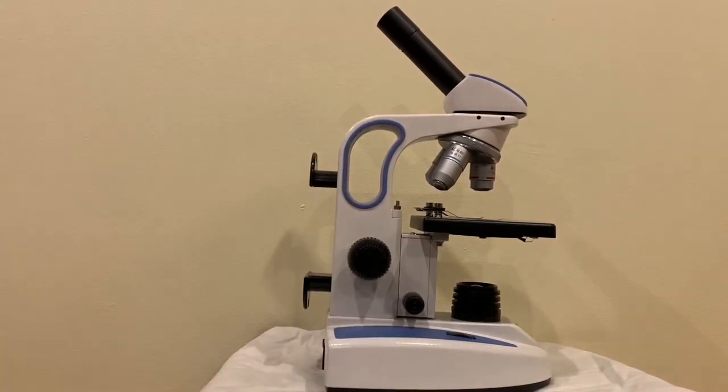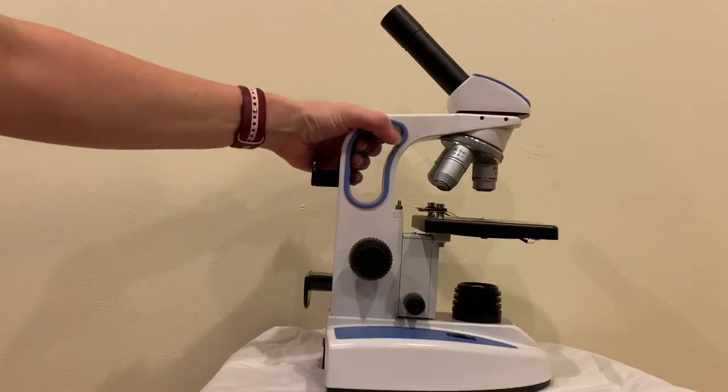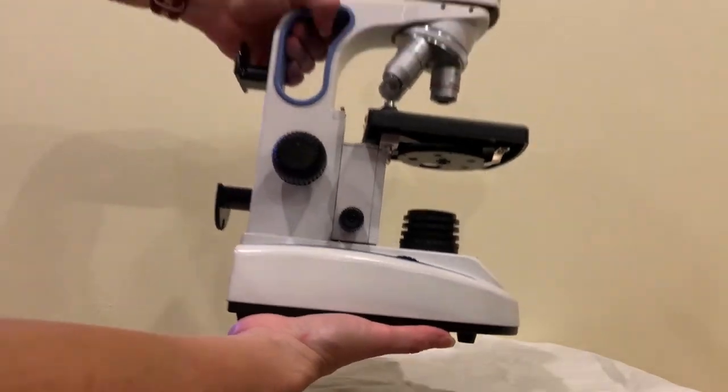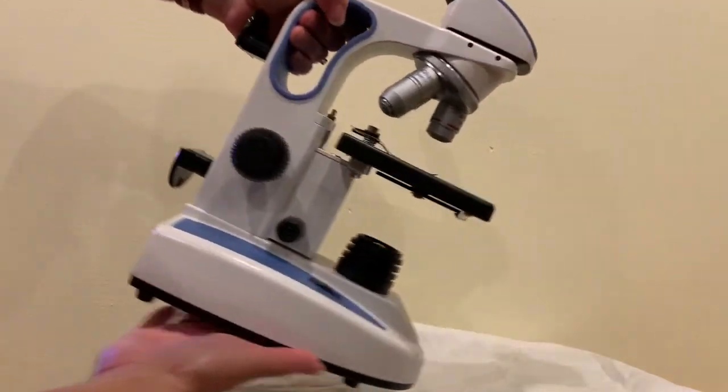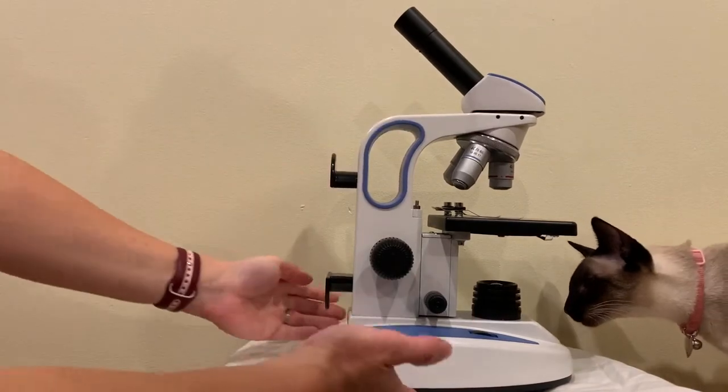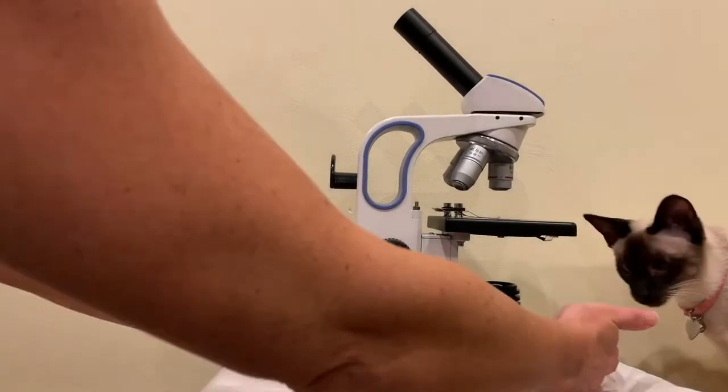If we want to move the microscope, we would pick it up from the arm and the base and move it around like this. We do not fling around the microscope, and when we place it down we make sure that all four feet are on the table.